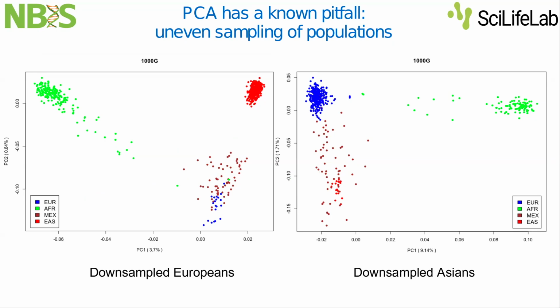So there are workarounds here. You can renormalize your variance covariance matrix, so computationally you can compute it in a better way. Or as you said, for example, you can downsample your reference clusters. I have a question. Here you're only visualizing the first two components. If you would add in more components, would this effect not be as strong then? Yeah, absolutely. I'll come to this.